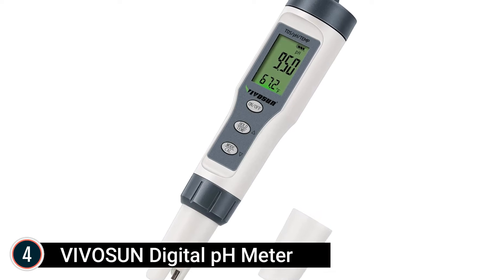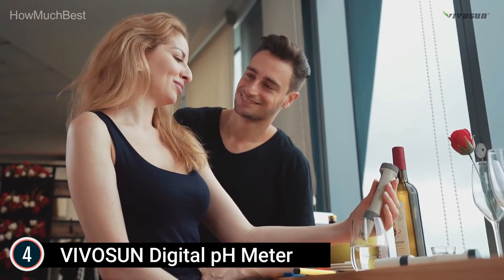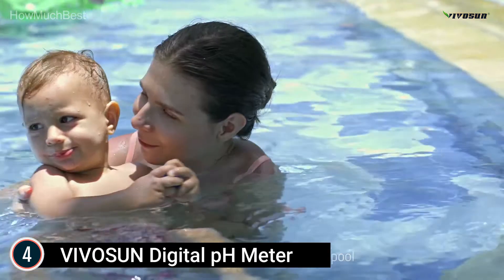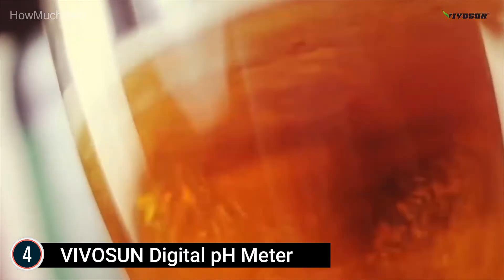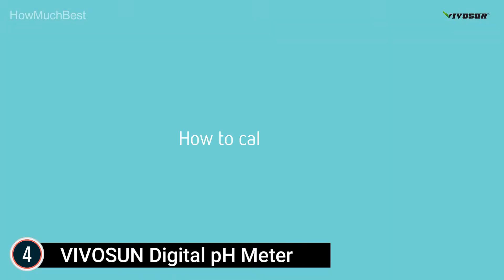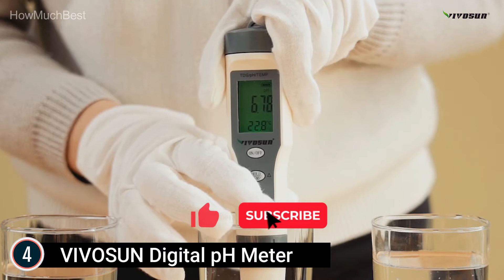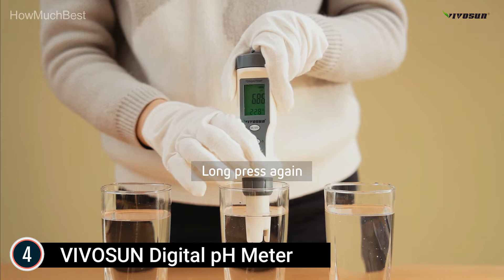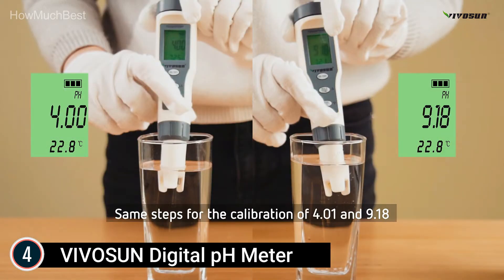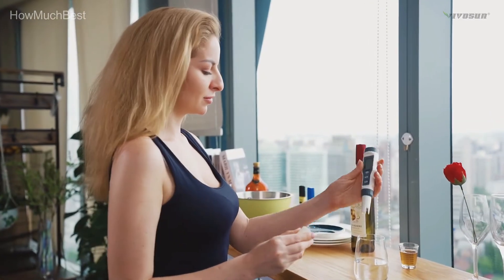Number 4: Vivicine Digital pH Meter. Three modes in one — with the Vivicine 3-in-1 pH meter, you can accurately determine pH, TDS, and temperature values to discover your water's quality and ensure your family's health. It features automatic 3-point calibration, automatically recognizing calibration solutions of pH 4.00, pH 6.86, and pH 9.18. High accuracy — the extremely sensitive probe offers a full measurement range of 0–14 pH with 0.01 pH resolution. The eco-friendly backlit display ensures you can read results under any conditions. With Vivicine's ATC, the meter can accurately read values across a broad temperature range of 32 to 140 degrees Fahrenheit, solving the issue of unreliable measurements caused by changes in liquid temperature.